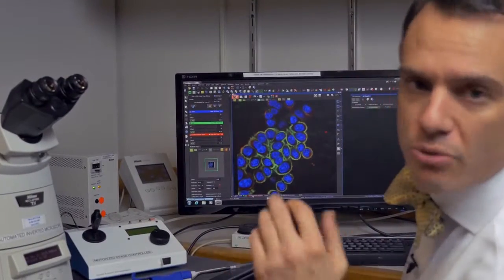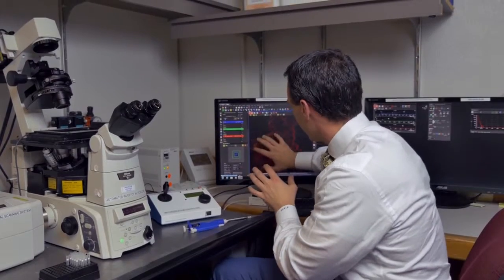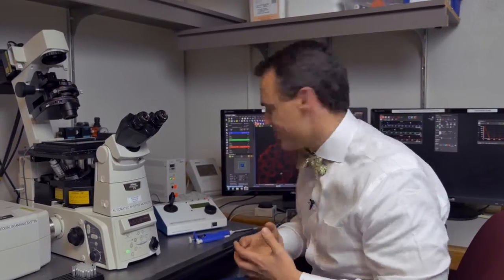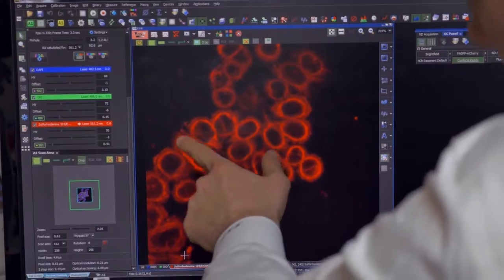Now if you remember, before it was completely black. We now see how the essential oil is outlining the cell membrane, being incorporated and passing through the cell membrane, becoming active inside the cell. And what is so amazing, and this is so inspiring to me, is we see ultimately that these cells continually enrich for these essential oils, that they continually take them in and utilize them.